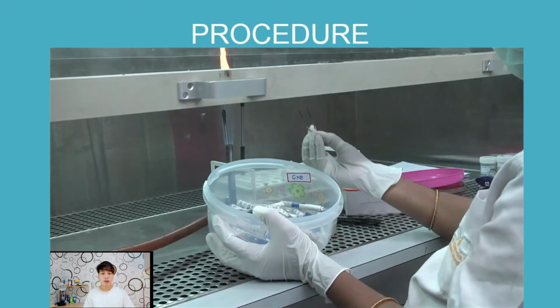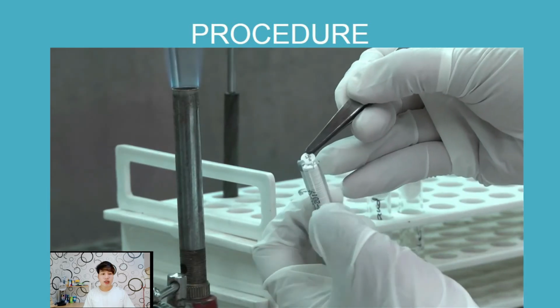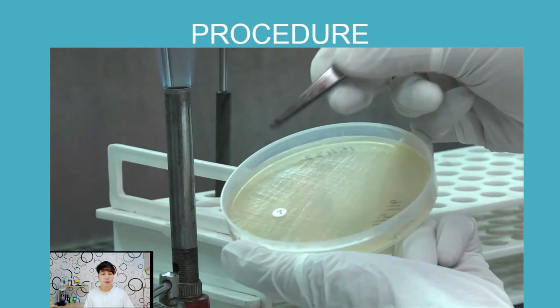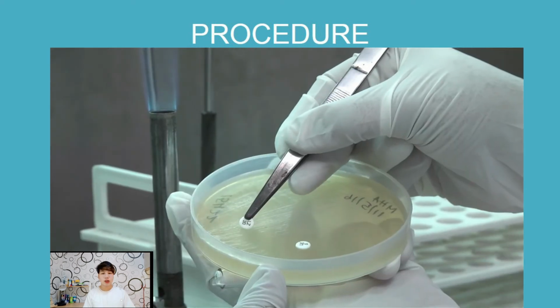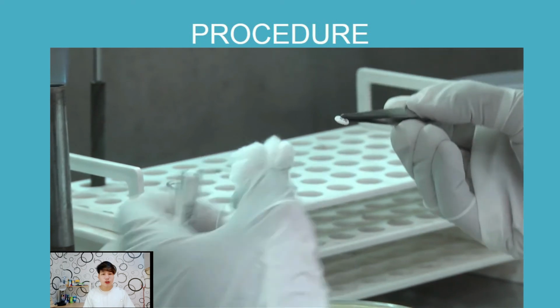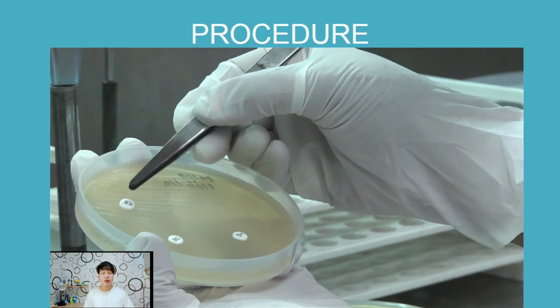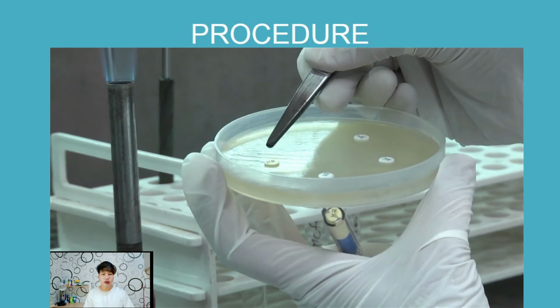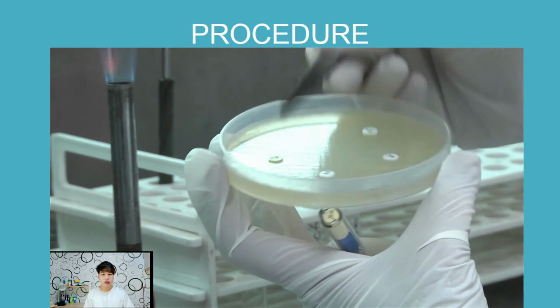Using a sterile forceps or a multi-disc dispenser, place the antibiotic discs evenly distributed in the plate. Take note, it should be 15 millimeters from the edge of the plate and no closer than 25 millimeters from disc to disc. No more than 6 discs should be applied on a single 90 millimeters Petri dish. Each disc should be pressed down to ensure contact with the agar, and it should not be moved once it touches the surface of the agar.